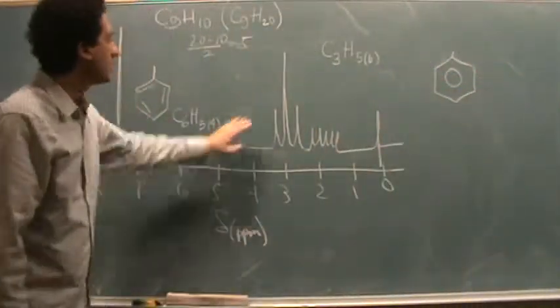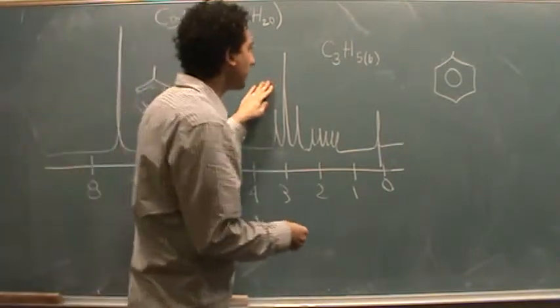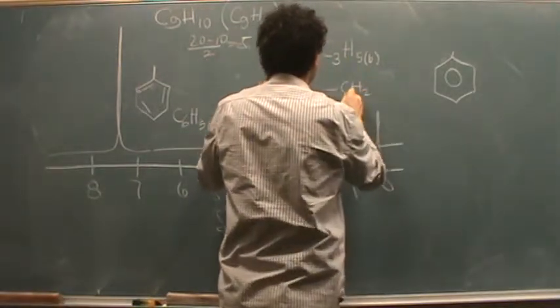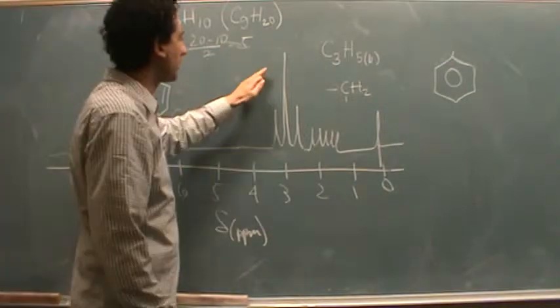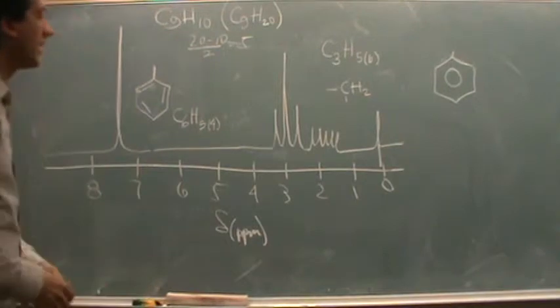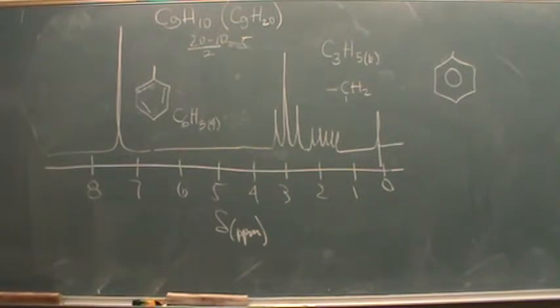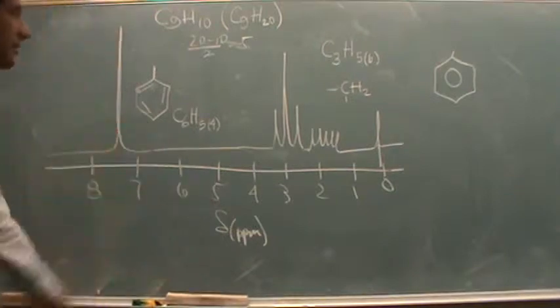Let's take a look over here. These hydrogens are next to 2 other hydrogens. So we know because of this, there has to be a CH2 somewhere. Because these are next to 2 other hydrogens. I guess there could be 2 CHs, though, however, since we have so few carbons left, it doesn't seem like 2 CHs is possible. So there's some amount of carbons here that are next to 2. And then here, it looks like there's some hydrogens next to a bunch of others. Hydrogens. I don't know how many. It could be like 4 or 5, whatever.